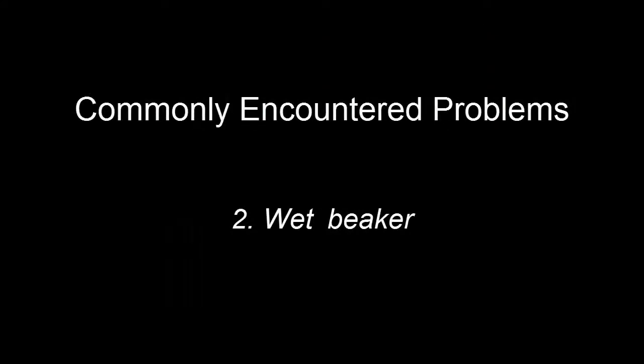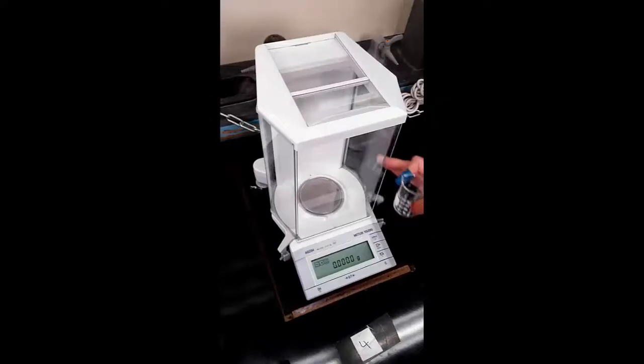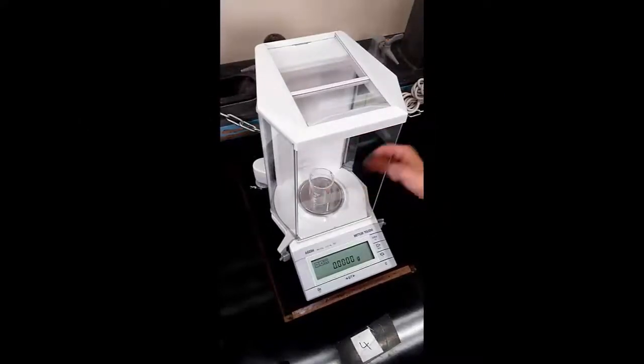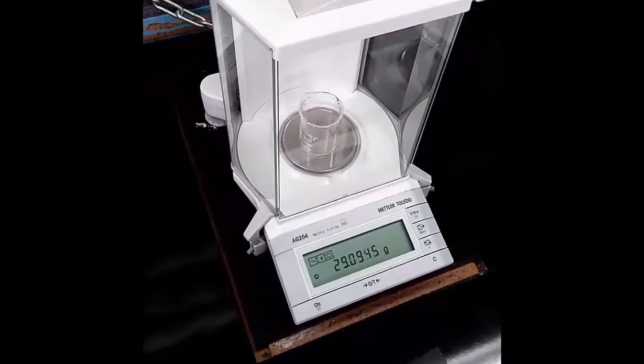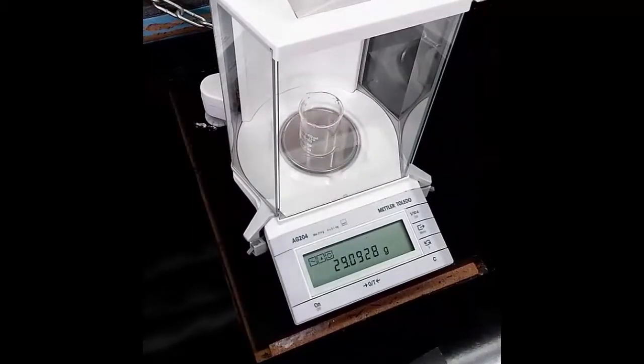2. Wet Beaker. A fraction of a drop of water or other volatile substance on a beaker may cause problems. Balance readings that continually drift downwards generally result from evaporation when either the object being weighed or the balance pan is wet.